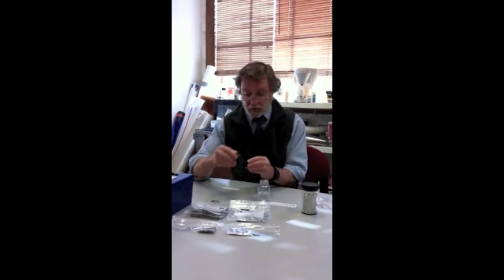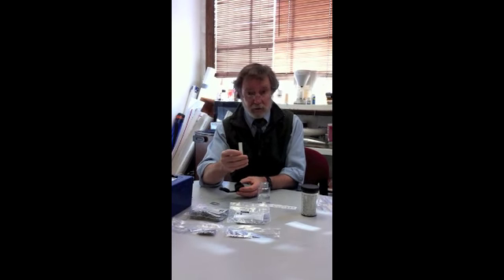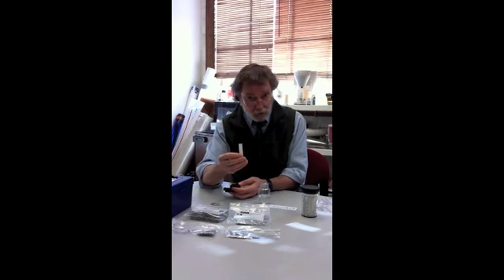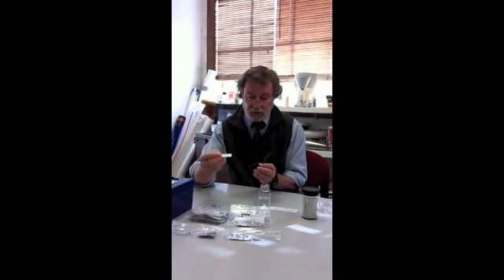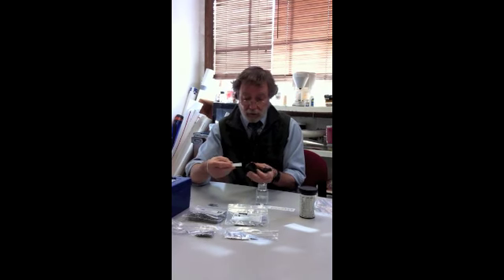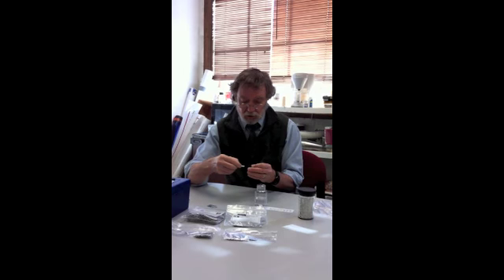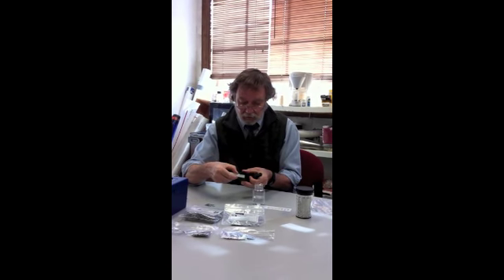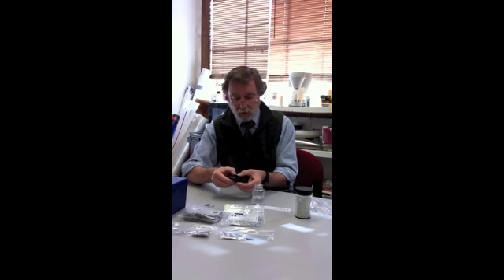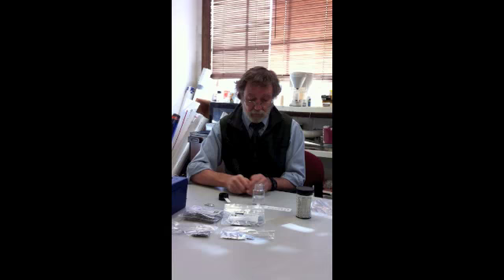While that's swirling and dissolving, the next stage of the procedure is to load the test strip into the cap of the vessel. So you pull the retaining part of the vessel apart, and you'll notice that the test strip has got a square of what looks like filter paper on the end. This is impregnated with the mercuric bromide reagent, and you want to load this into the cap so that the mercuric bromide part of it is facing down over the hole. And there is a groove in the cap that will hold the test strip in place. So you slide the strip in here up to the end, and then it's securely retained. Then you put the retaining cap over the top and press it down. And now we're ready to move on to the second part of the demonstration.